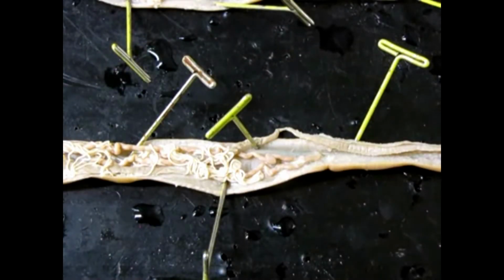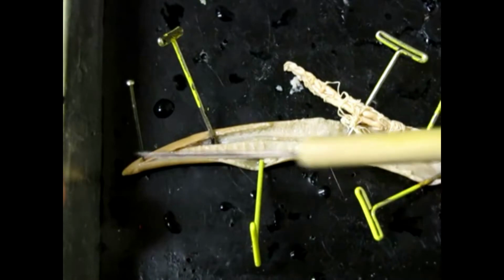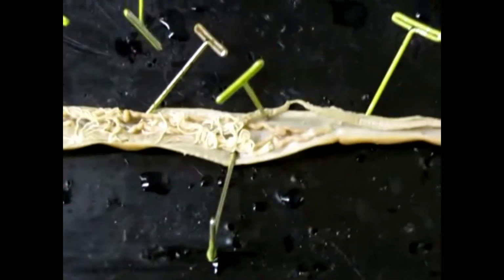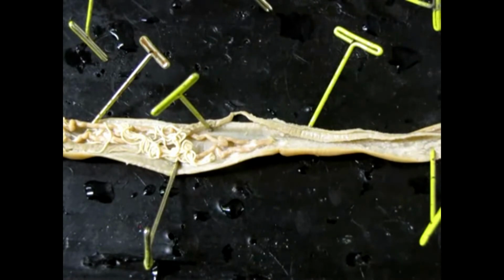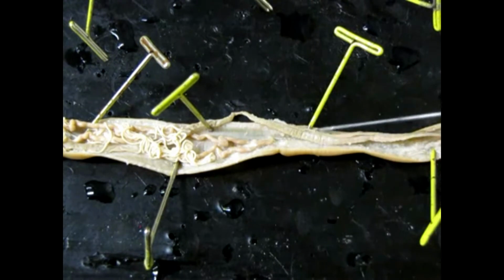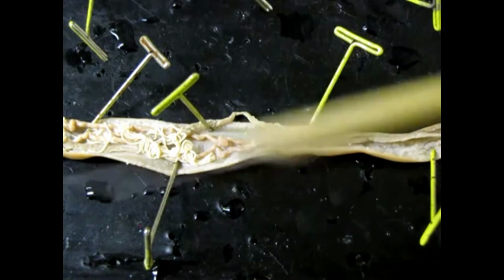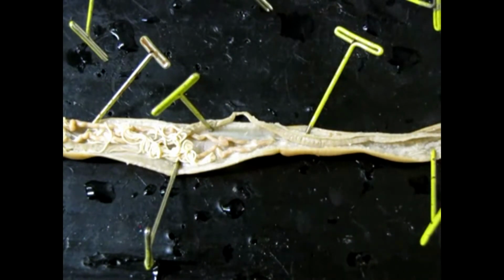So now we're going to look at the internal anatomy of the roundworm, first starting with the female. Just to orient you, up here I have the anterior end, which has the mouth. At the other side is the posterior, which has the anus. Okay. Now, running the entire length of the body from the mouth to the anus is this long, thin, flat, ribbon-like structure. This is the intestine, okay? And obviously this is responsible for the passage of food from the mouth through the intestine. And unlike other animals we've seen so far, this is a complete digestive system in that it has both a mouth and an anus.